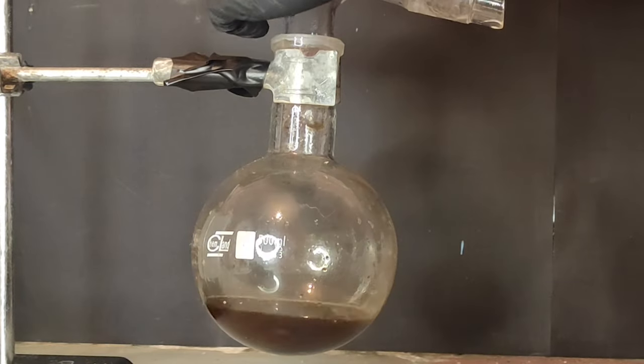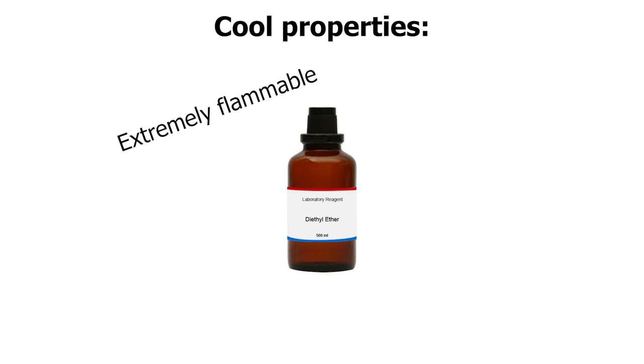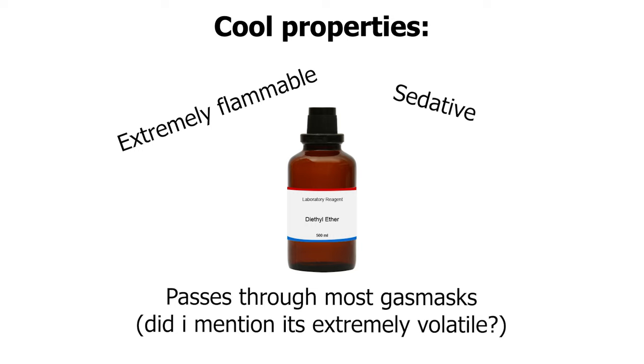Now that we have our nicotine water solution, we must extract it. For this extraction I've picked diethyl ether. One of its cool properties is that it's extremely flammable, a sedative, and passes through almost every gas mask, including the one I have.